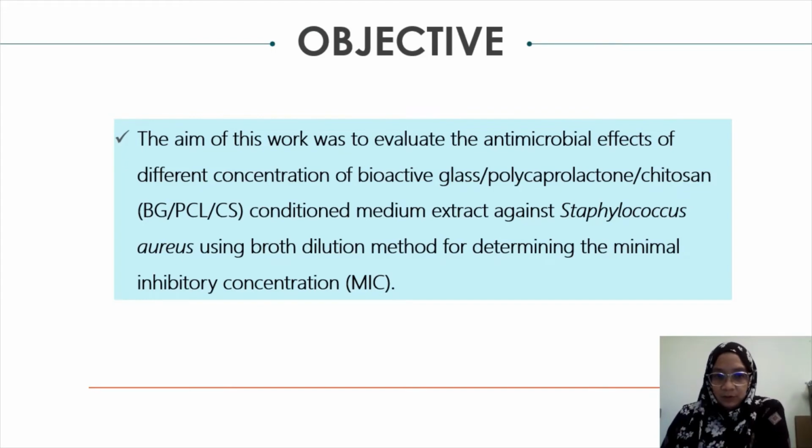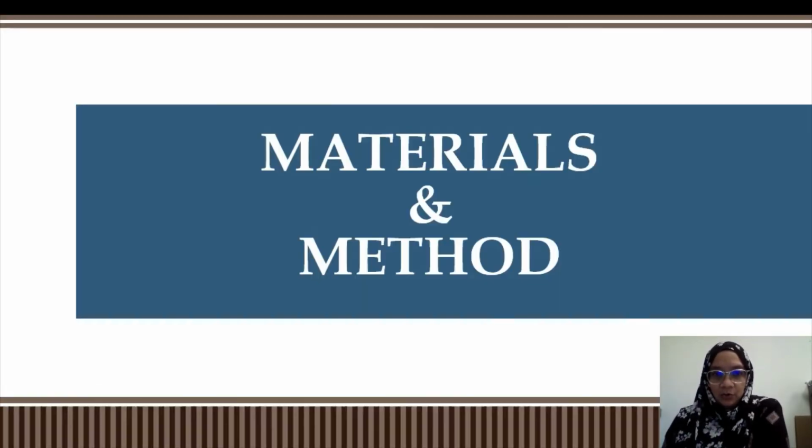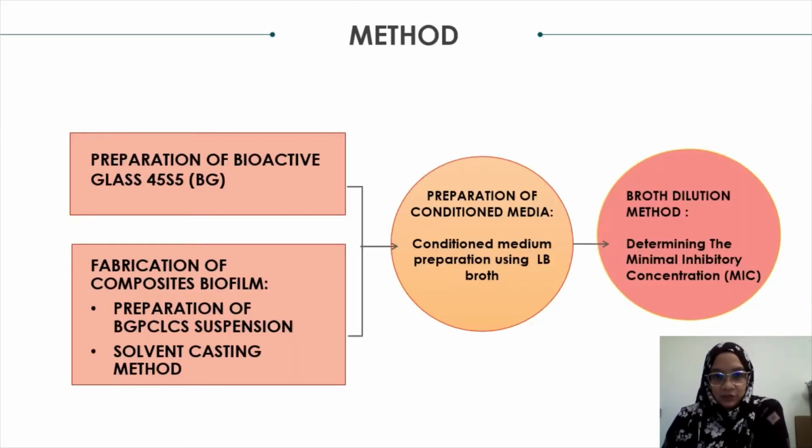The aim of this work was to evaluate the antimicrobial effects of different concentration of BGPCL CS conditioned medium extract against Staphylococcus aureus using broth dilution method for determining the minimal inhibitory concentration. Now let's move to the material and methods of the presentation. The study methodology is structured as follows.